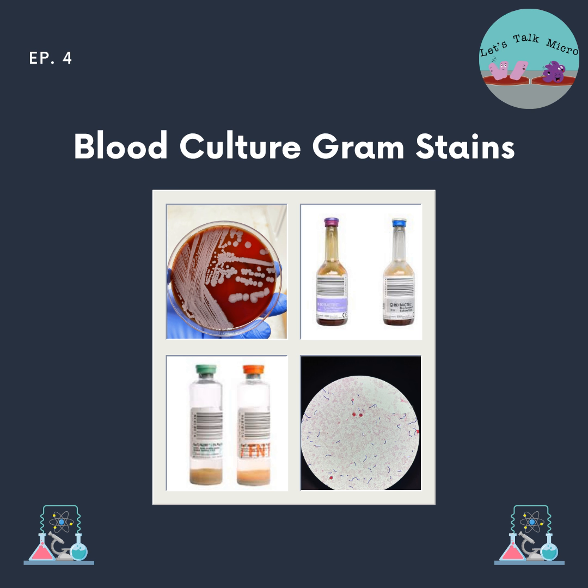So then you're looking for your organisms, and those you report, and you report the gram positive, gram negative. You report the morphology: cocci, rods, coccobacilli, yeast, pseudohyphae. Remember, even though yeast stain positive, you do not report them as gram positive. That's also a good indicator of your stain.